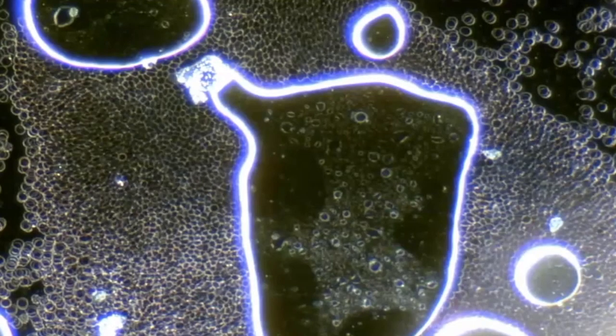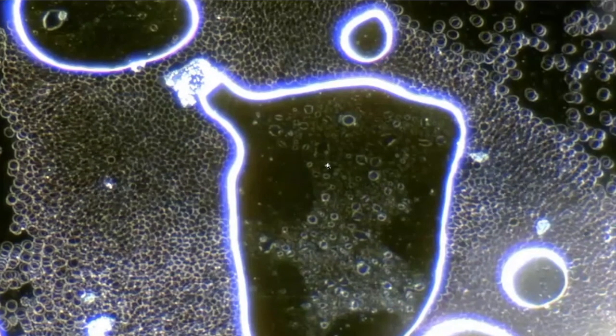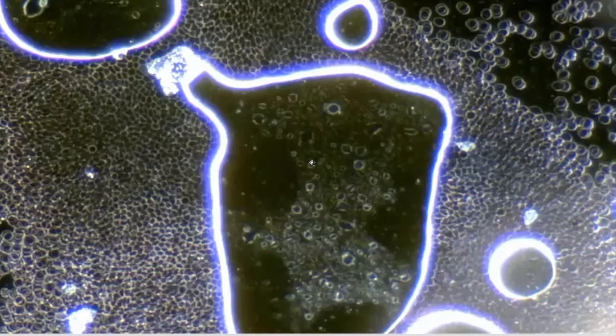So I want to show what product looks like under the microscope for dark field microscopy, so people can get an idea that when people are looking at things and making assumptions, it's not necessarily correct. Just looking at blood, for example, which I think a lot of us are familiar with, these hydrogel, what we're calling construction sites, made of polymers. Possibly. As a dark field microscopist, again, I can't say what they are or aren't made of because I don't have the correct microscope to make that assumption. But there are people out there who have done that, such as Dr. Young, who does have the correct microscope with spectrometry to name substances within structures that we're looking at.